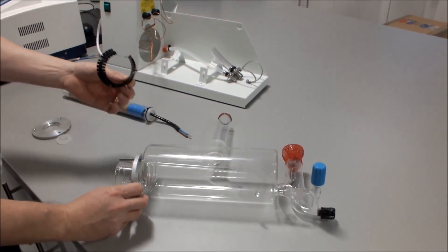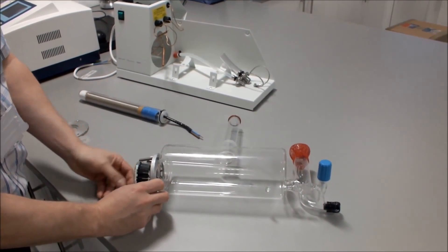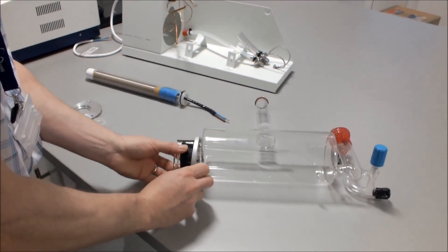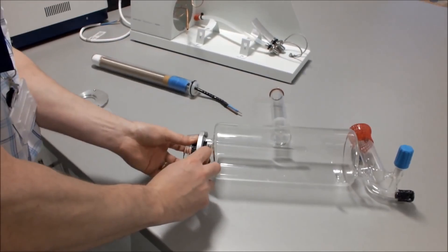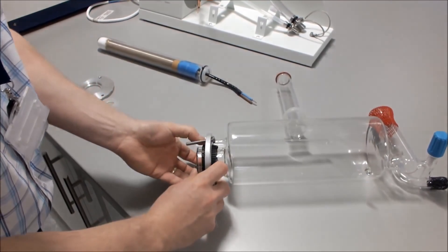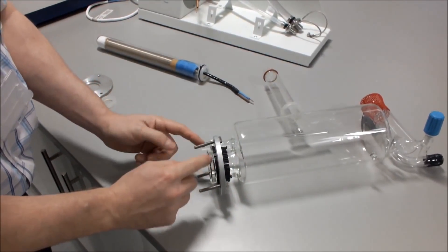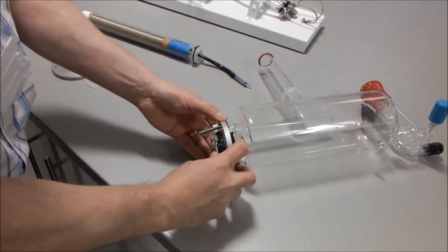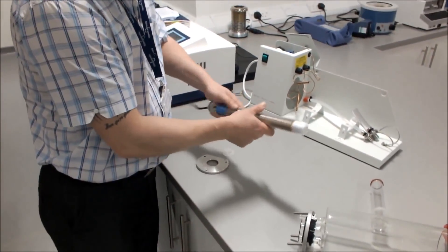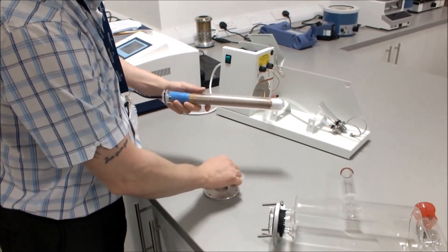We then take our plastic insert and place it over the opening of the boiler. Where the insert is open, put that to the top, squeeze it down, and push the flange over the plastic insert. Then pull the flange and plastic insert towards the end of the boiler. We then take our heater and fit our aluminium plate and silicon O-ring onto it.